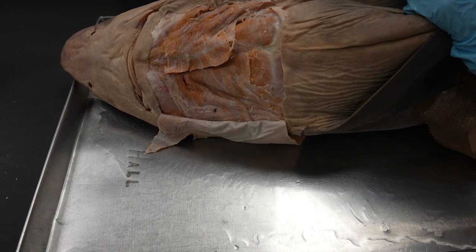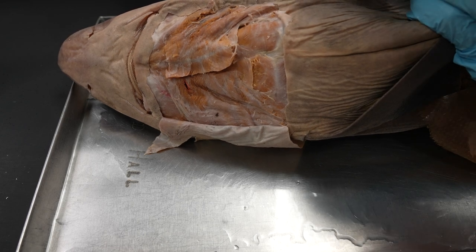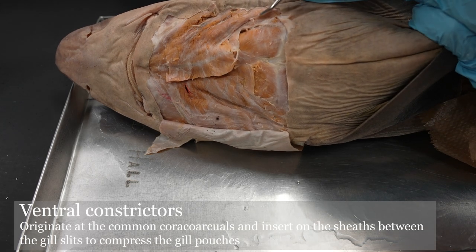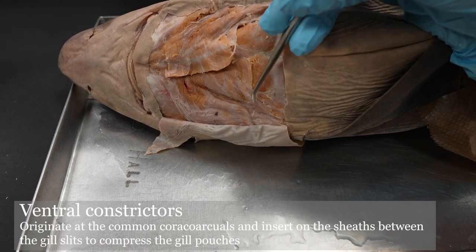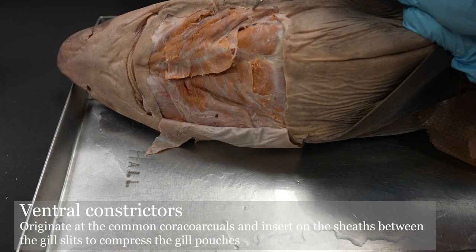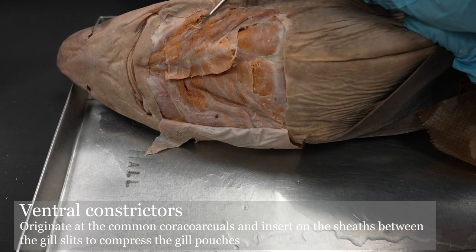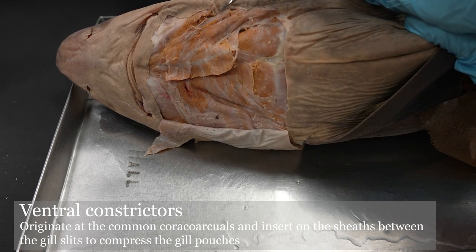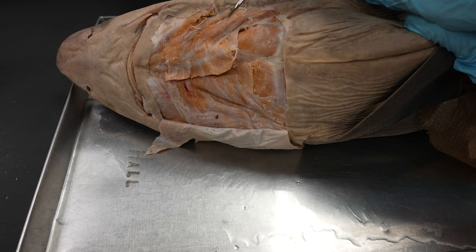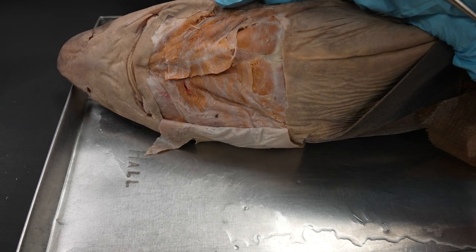Along the base of the gills you'll find these very thin muscles called the ventral constrictors. Those are often torn, especially when you dissect this the first time. There's a little torn up on mine as well — that was like that when I started. Anyway, that does it for the cephalic and branchial musculature.